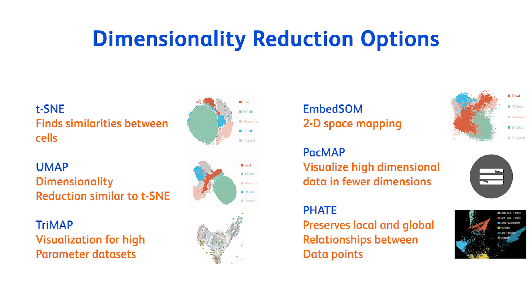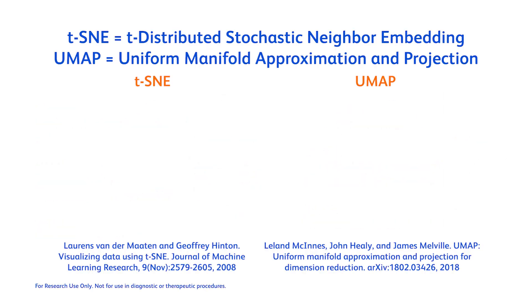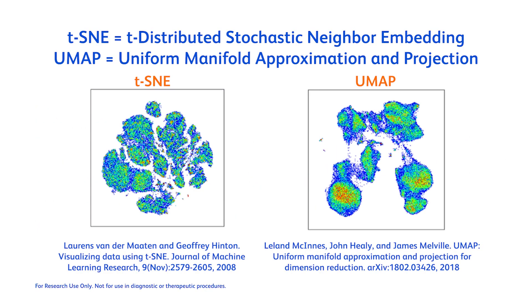Within FlowJo, we currently have six dimensional reduction algorithms: t-SNE, UMAP, TriMap, PaCMAP, BidSum, and FATE. The most commonly used in the field are t-SNE and UMAP.